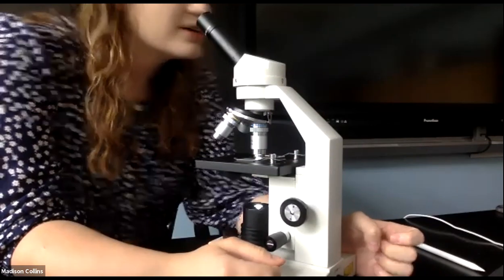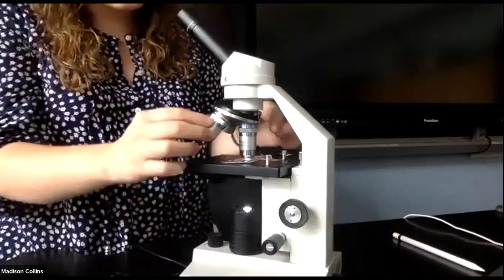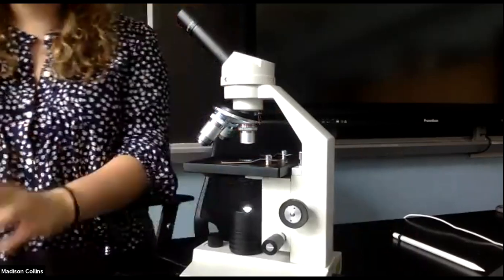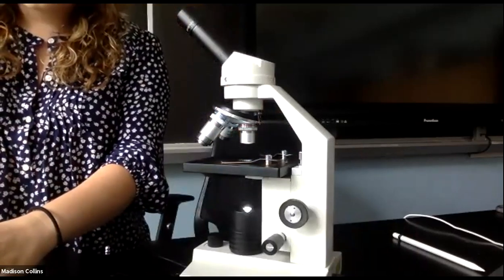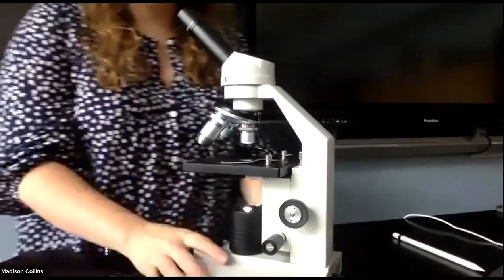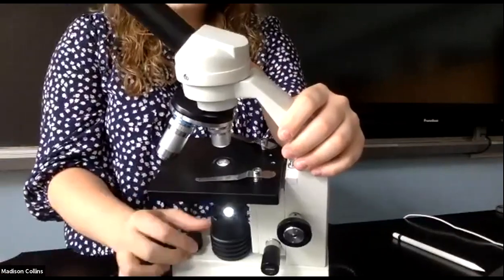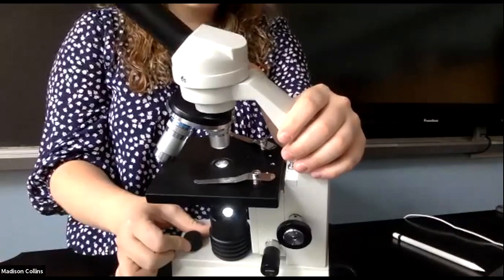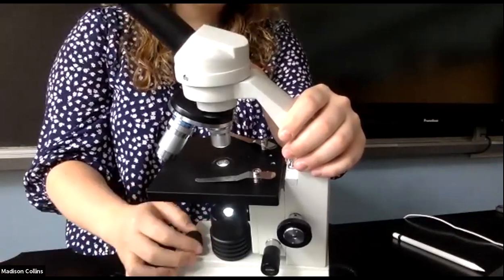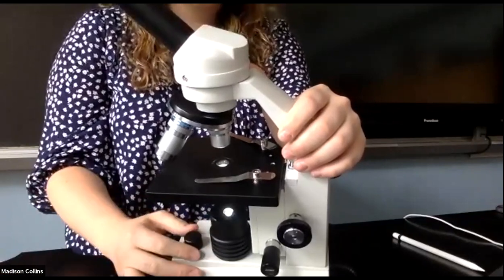All right, I'm actually going to take this slide off. So I'm going to remove the stage clips and say goodbye to our slide. Okay, now what actually allows us to view this specimen is the presence of light down here. So this lamp is what illuminates our object so that we're able to see it more clearly. So this down here is your lamp or your light that gives us the ability to view the image.